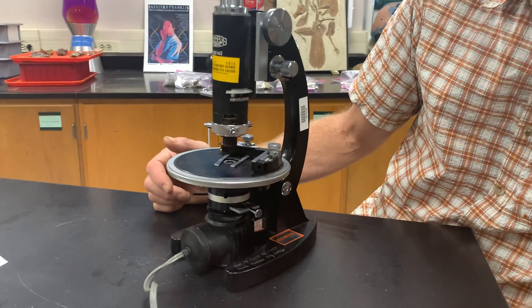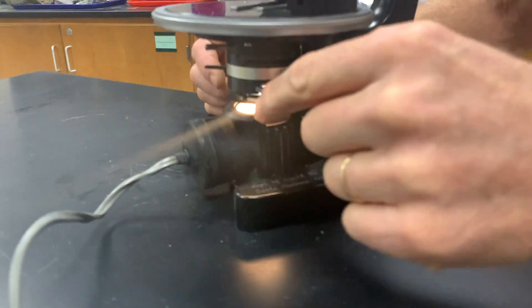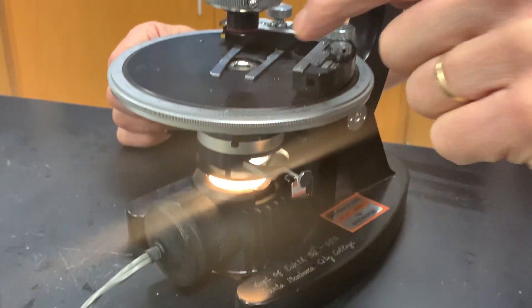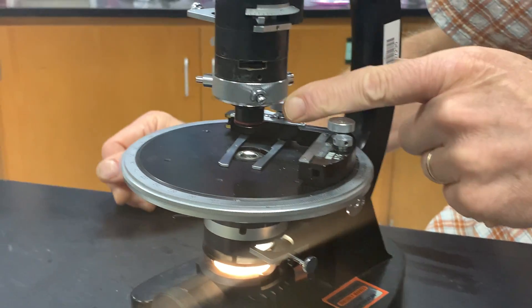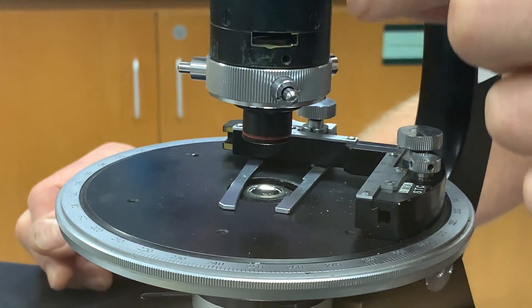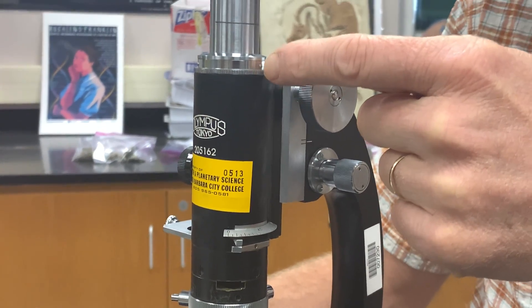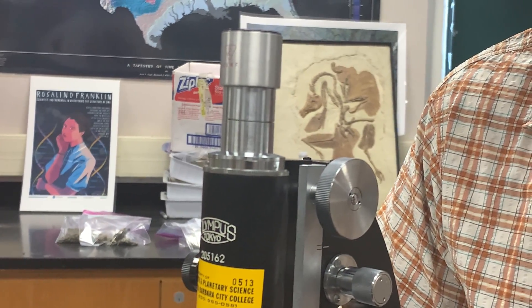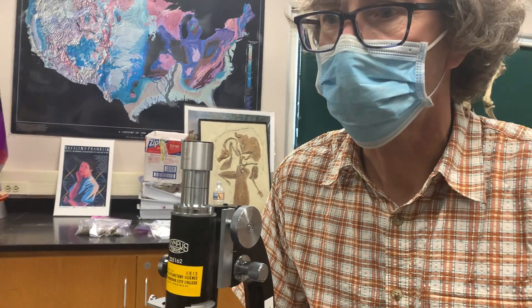We have a light source, and it very simply creates a column of light that comes through a polarizing filter down below. Then it goes through one lens right underneath the stage, and then the light comes up through what's called the objective lens, or just the objective. The objective is the main thing that you can change to change the magnification. Then the column of light goes through the tube and through what's called the ocular, or the eyepiece, which is itself another lens. Most oculars are 10 power.